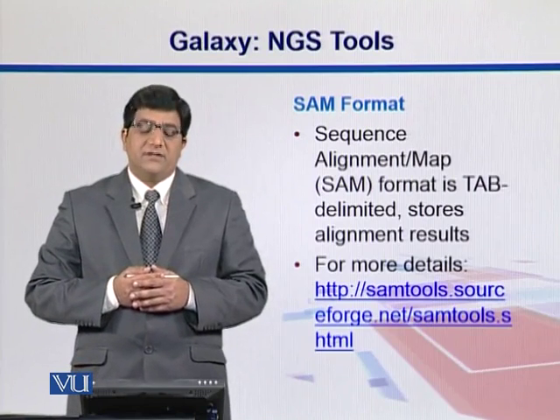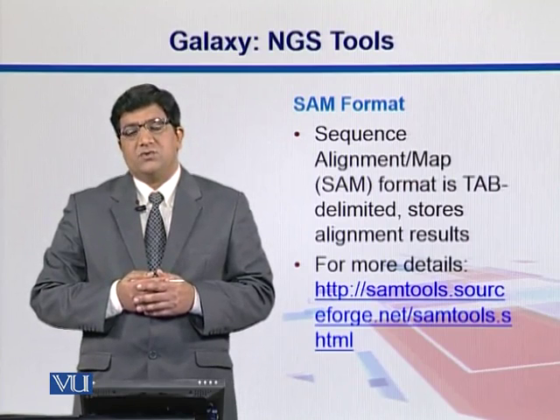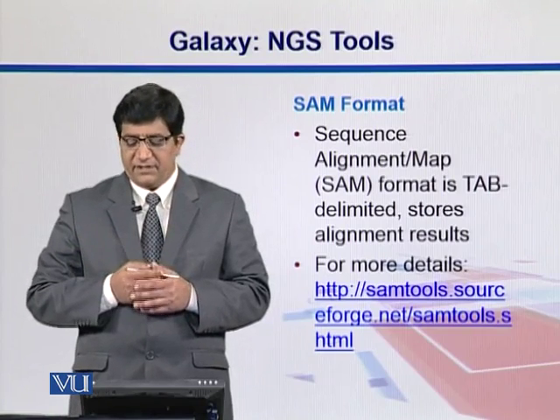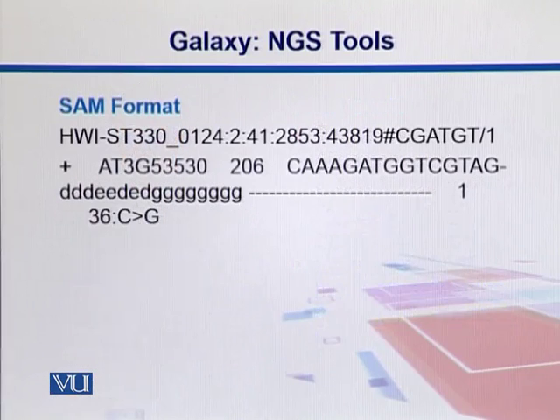What is SAM format? SAM is actually the Sequence Alignment Map. Once the aligner aligns the files, it gives you the alignment reports in this format. For details, you can obviously look into this web link over there. So here is a SAM format, a little bit of description.